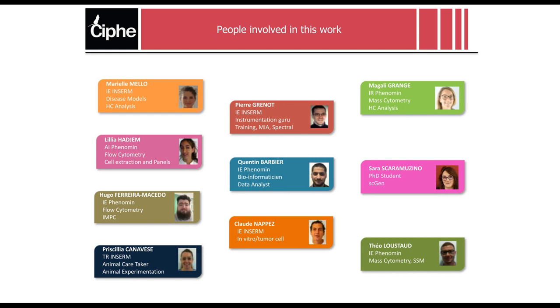Okay, so for license management, we use what is called Premium Cytobank. All the license management is actually not done by us, but by the Beckman sales rep, which saves us a lot of time, and I think that's really good. Then you have to plan the license cost in advance in your project. For example, for Selfedia, when we applied for the project, we applied for money for the Cytobank license for 1 year. This got extended for a second year due to the COVID situation.